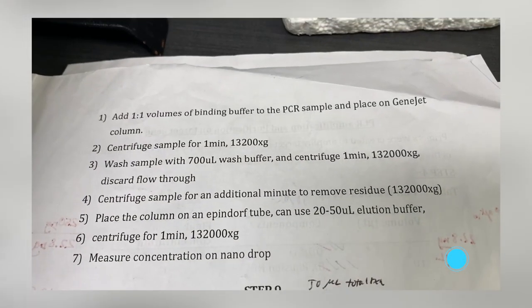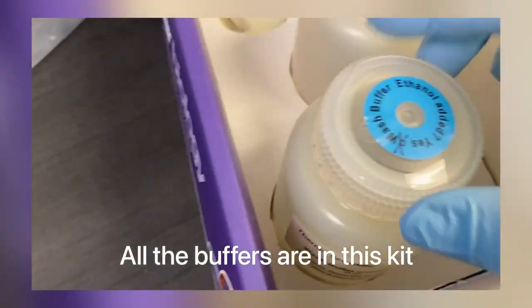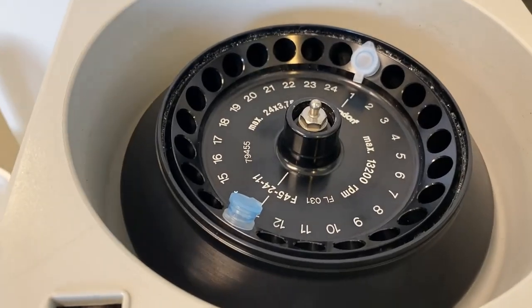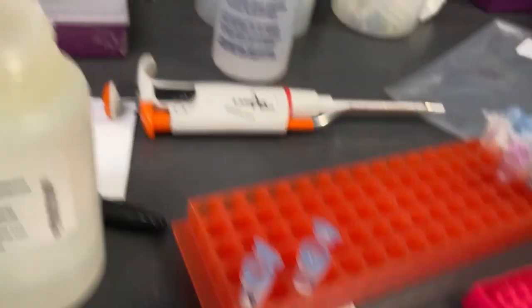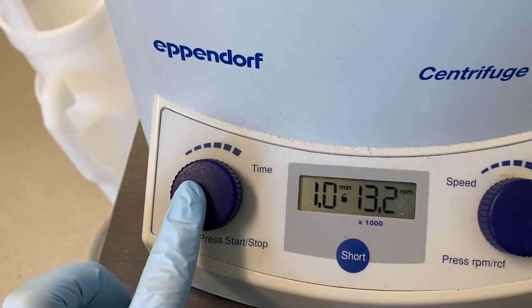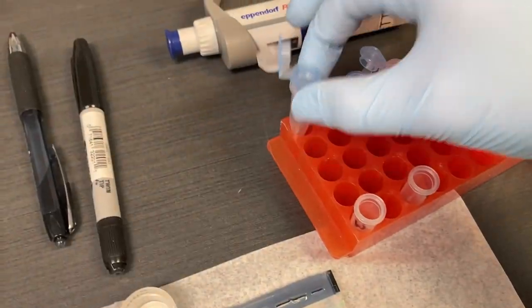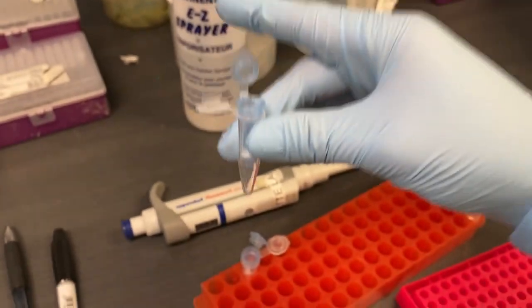I'm basically following the steps. I'm going to wash it and spin it with the wash buffer. I'm always trying to put the little edges on the same side facing inward. Essentially the DNA is bound to this filter over here. The elution buffer is going to make all the DNA un-bind from that filter and flow through.